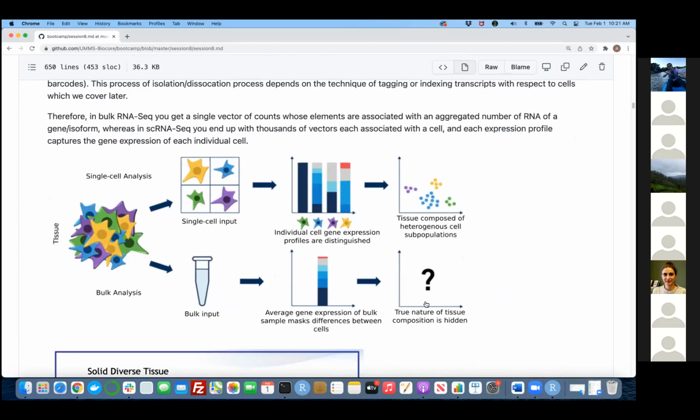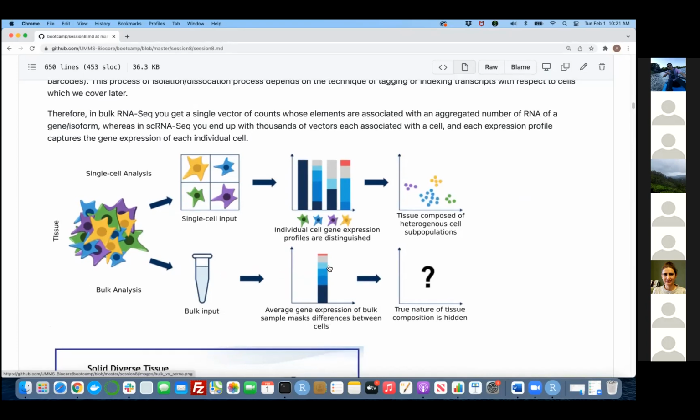So basically, to summarize, you have some tissue where you dissociate the cells first, but it may or may not be a mixture or a cocktail of cells where you need to know which cell types there are. You may really only need to see if, in a treatment case, some genes are up or down. Then you can just toss them into a library, get the RNA, amplify it, and see how many unique molecules are associated with genes after alignment, for each biological replica, right?